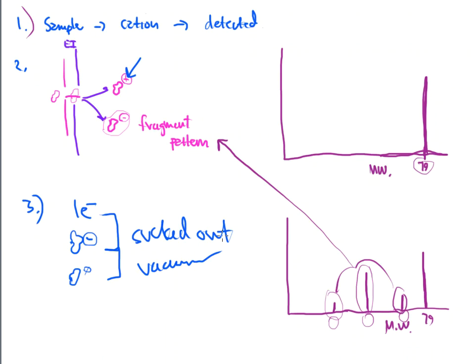Now, the vacuum's not the only thing that's going to do it. The vacuum's going to help pull it out. But there's going to be another piece in there that's going to help us with this kind of cleanup process before it reaches the detector unit. So we need to talk about that piece. But this is one of the reasons that a vacuum is going to be present.